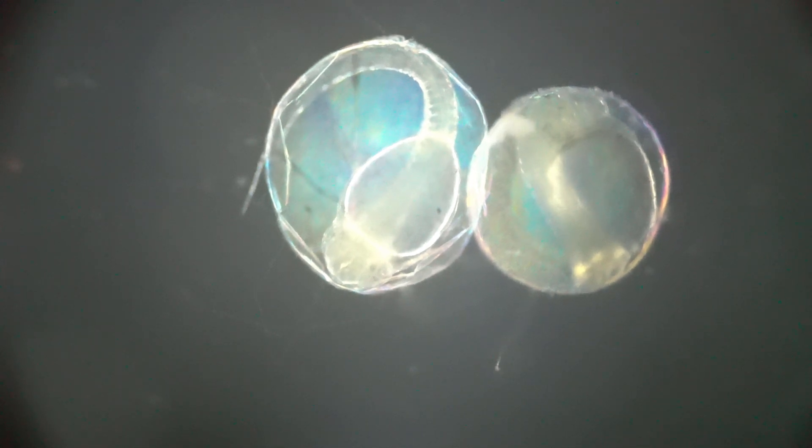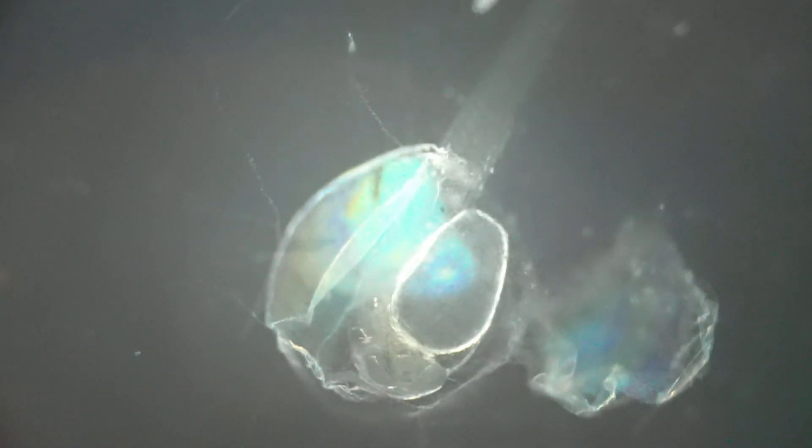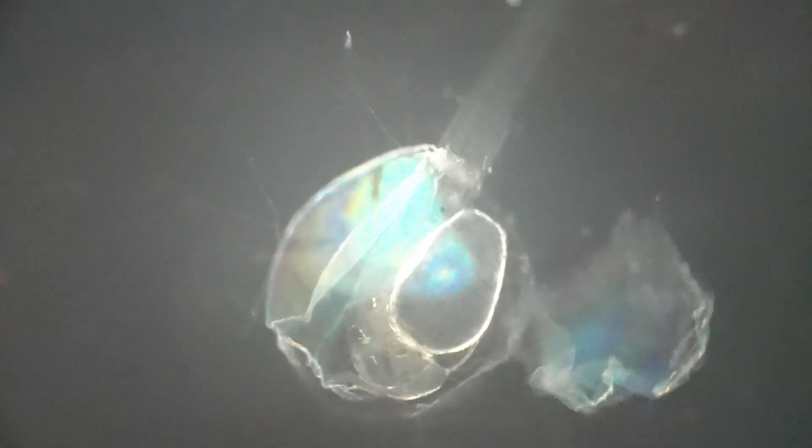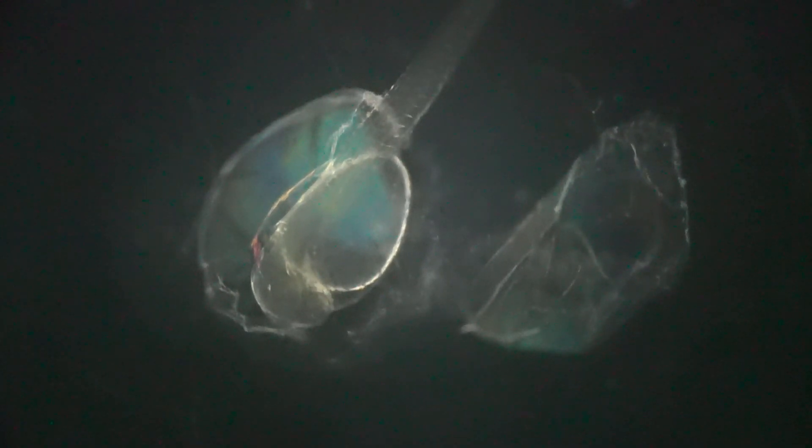So within the time it took me to go to the kitchen and get myself something to drink and come back, these eggs had hatched. This was really cool. You can see that this one fry is still within the membrane of the egg and it's just hanging out and taking its time.